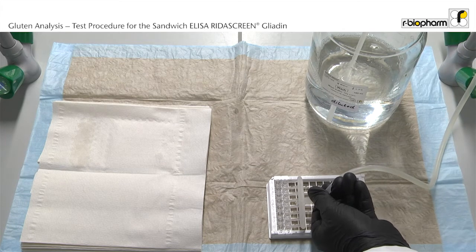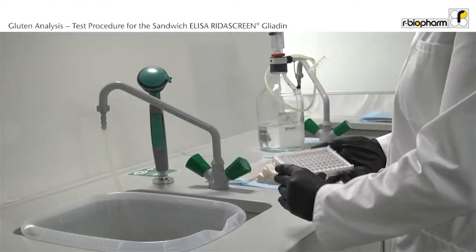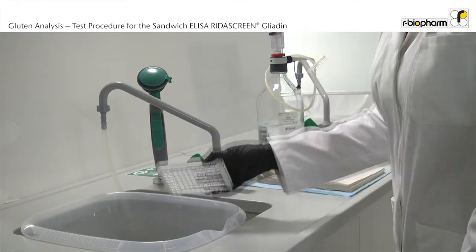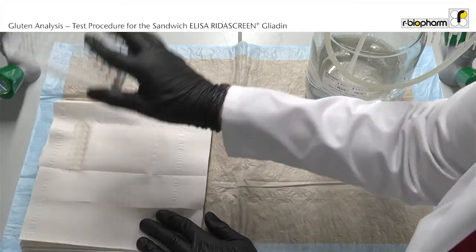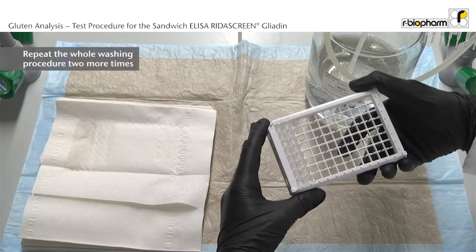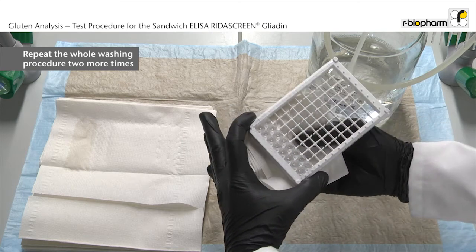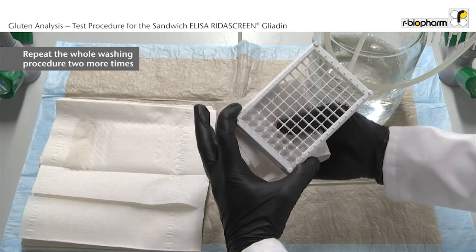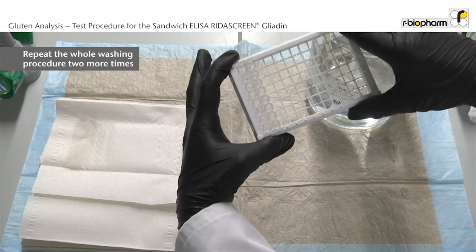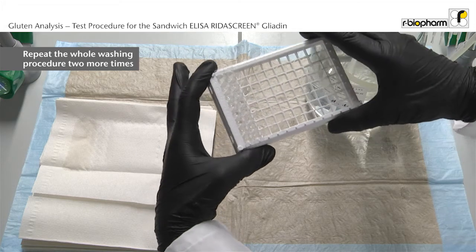Fill the wells evenly across the plate with 250 µl wash buffer. Discard the liquid from the wells using an angular and forceful motion to properly remove all liquid content. Repeat the washing step 2 more times. Also make sure to absorb any liquid from the plate frame and outside bottom of the wells. At the end, visually inspect the wells for residual wash buffer or bubbles and repeat tapping if necessary.